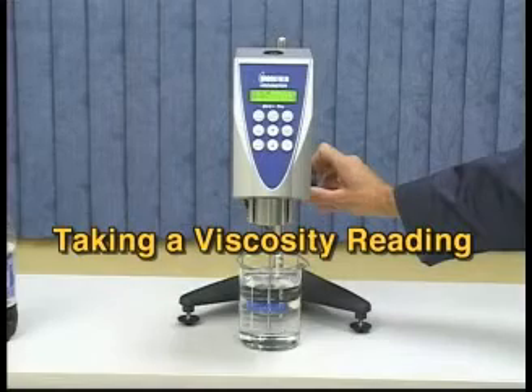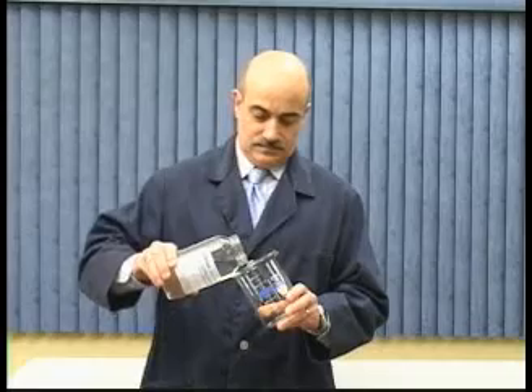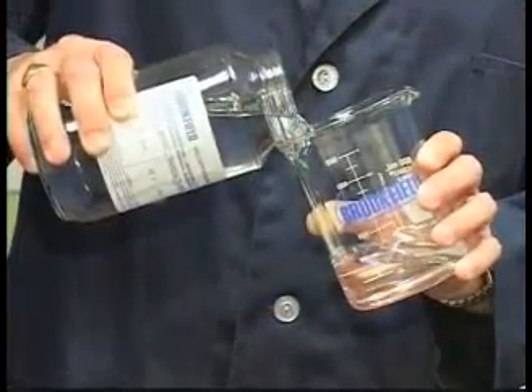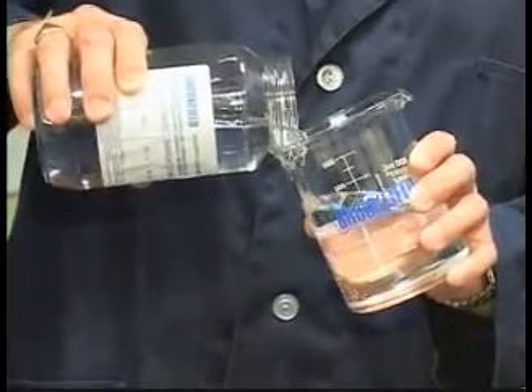Taking a viscosity reading. Start by filling your beaker with the sample material. Air bubbles in your sample can cause high readings. Tilting the beaker as you pour your sample will help limit air bubbles.